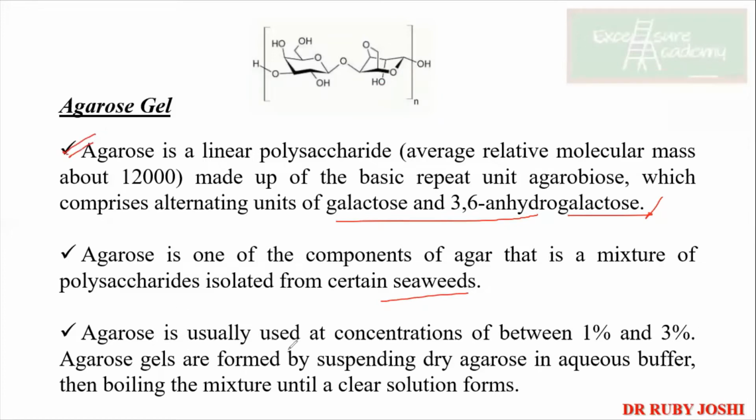Now, agarose is usually used at concentrations of between 1 and 3%. Well, 3% तो मैंने कभी use नहीं किया, and I have not heard also. But till 2% I have gone. Okay. So for your DNA, just to visualize and to see how much DNA is present or whether it got separated or not, you use around 0.8% of your agarose solution.